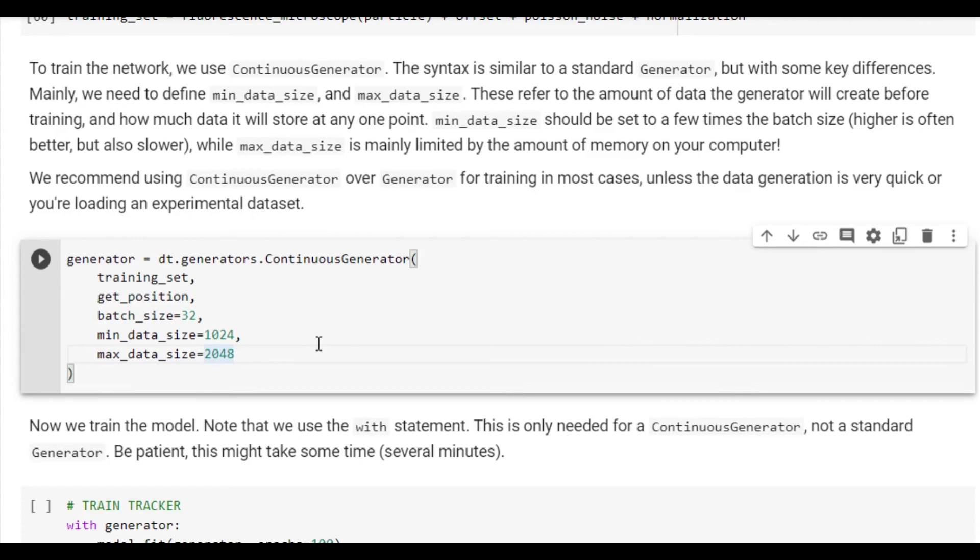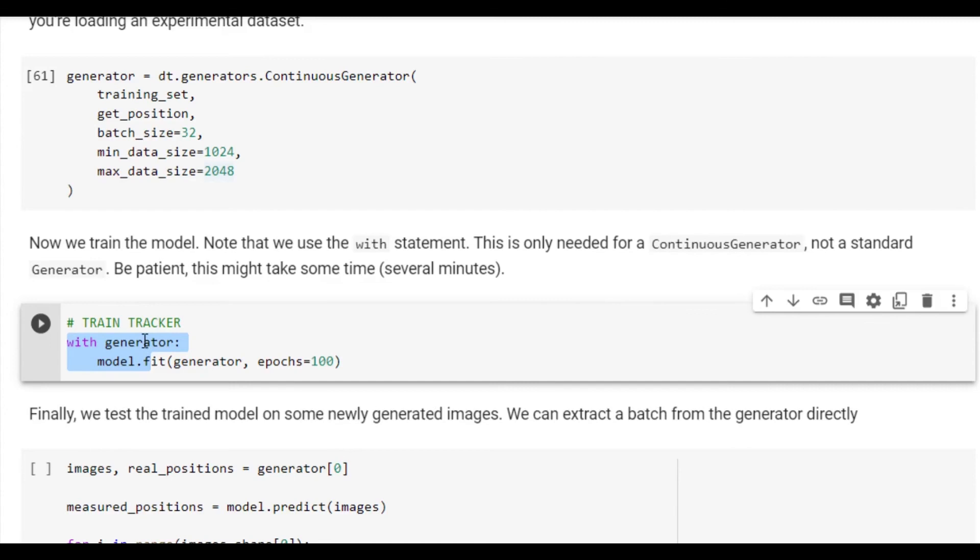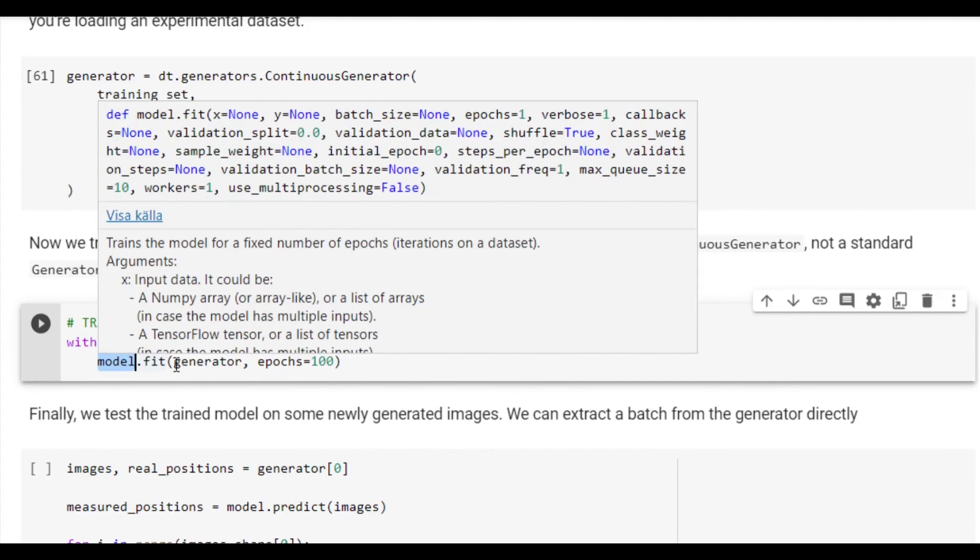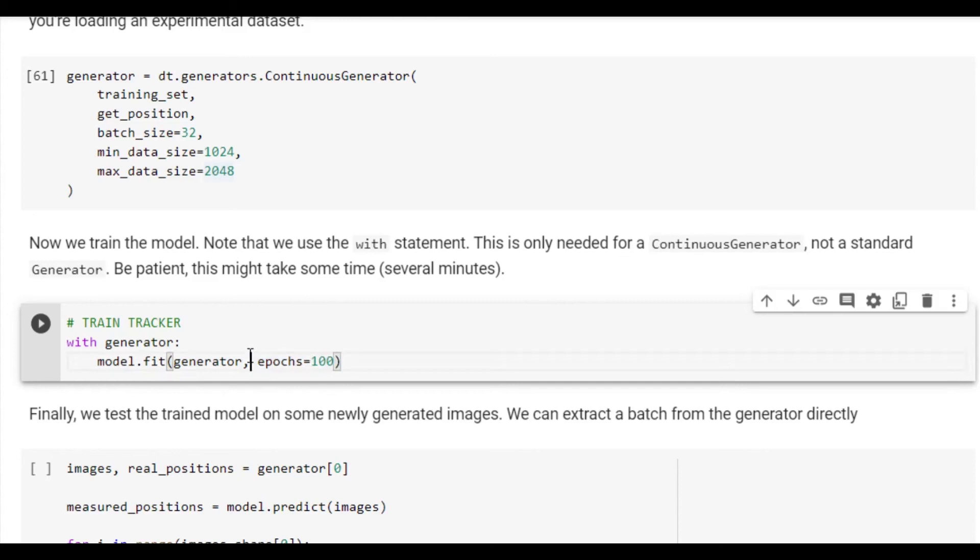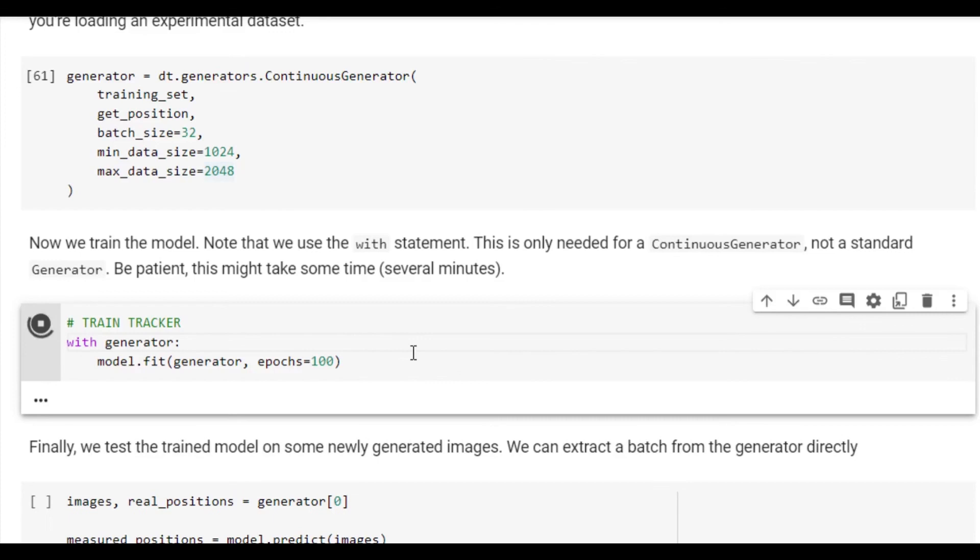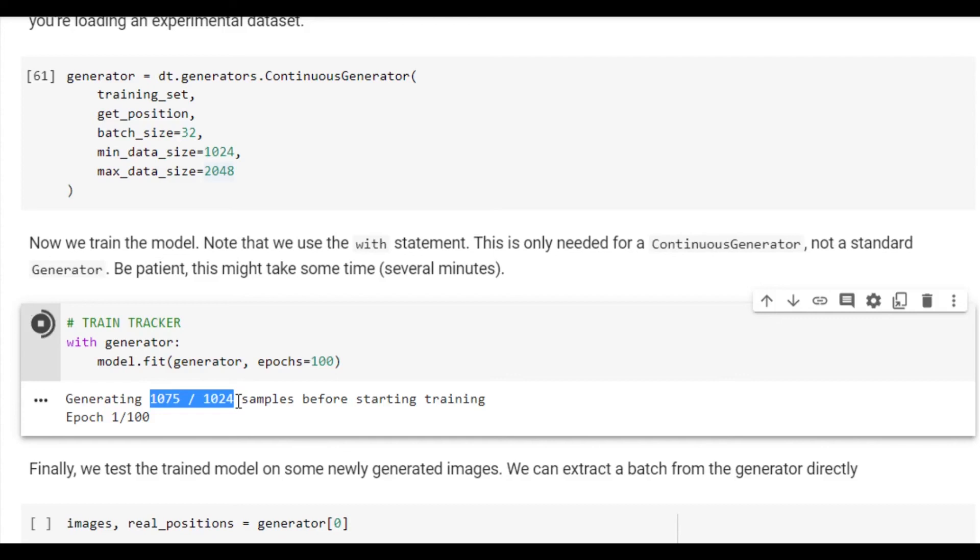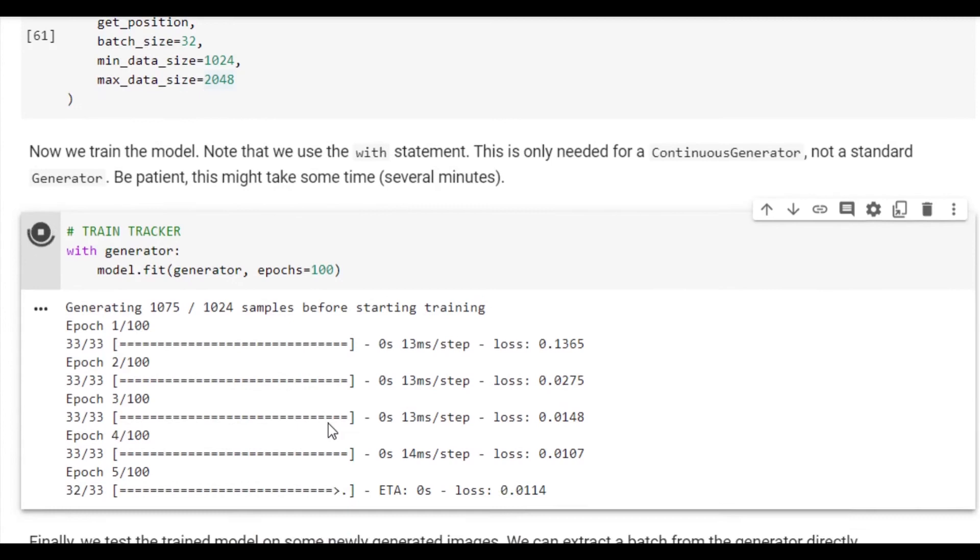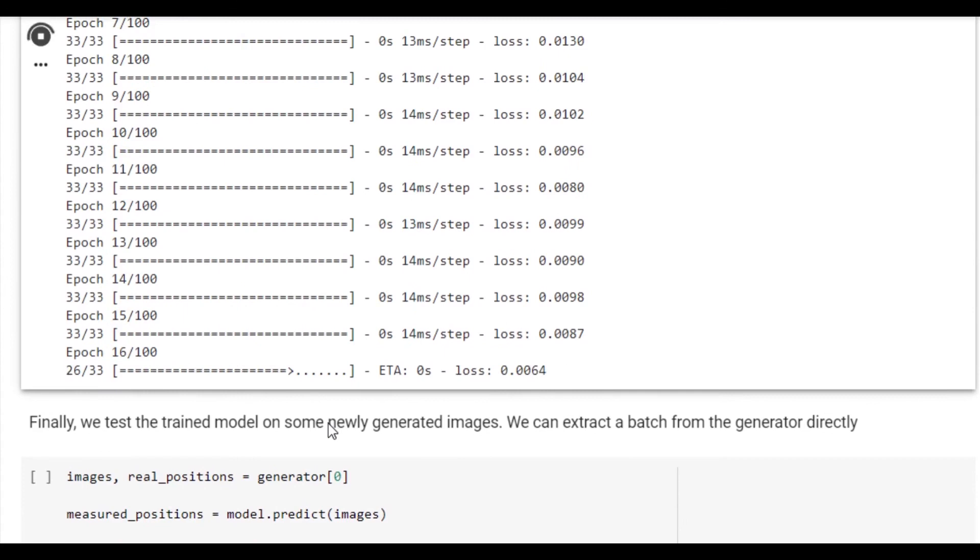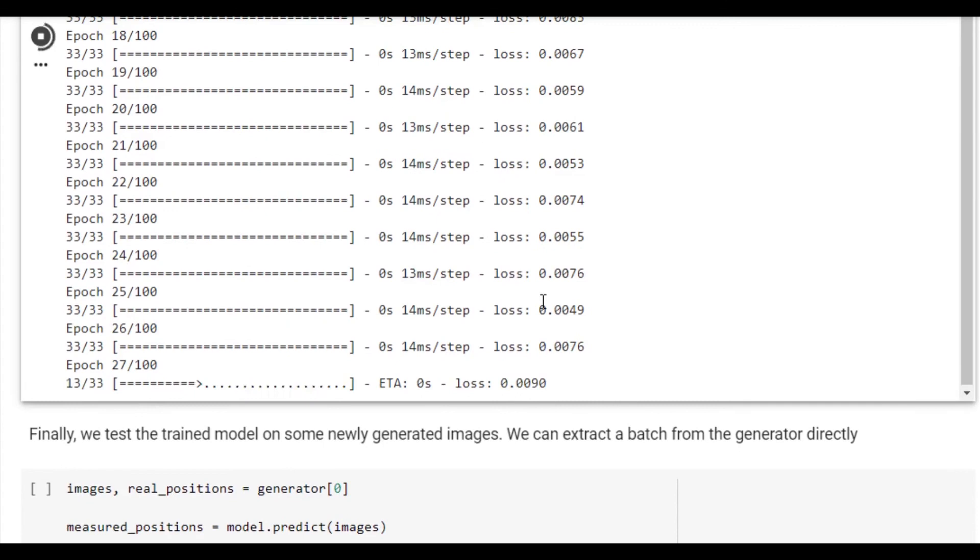To train the network, we only need these two lines. WithGenerator tells the generator that it is time to start creating images. The second line tells the model that you should start training using images from the generator and to train for 100 epochs. As this is just a Keras network, it accepts the same methods and arguments. It is finally time to start training the network. After just a few seconds, the generator has created enough images to start training, and the model is now being initialized. You can see the training being performed in real time, and it is pretty fast. You can also monitor the loss over time here on the right. I will speed up the rest of the training.